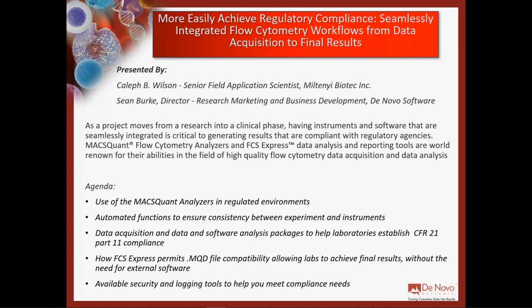For the presentations today, Caleph is going to guide us through the use of the MACSQuant analyzers in regulated environments, and also talk about automated functionality to ensure consistency between experiments and instruments. Then we're going to cover some of the intersections between data acquisition and data analysis software packages to help establish CFR 21 Part 11 compliance.